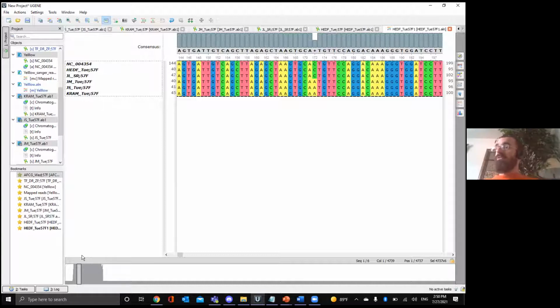So that's why your flies are yellow, that have that single base change. And so this shows you graphically, both in the actual alignment, the colored blocks, but also in the consensus bars at the top. It shows you this is the thing you're interested in, right? This is the base change that makes the difference between brown-bodied versus yellow-bodied flies. It's all just that one base.